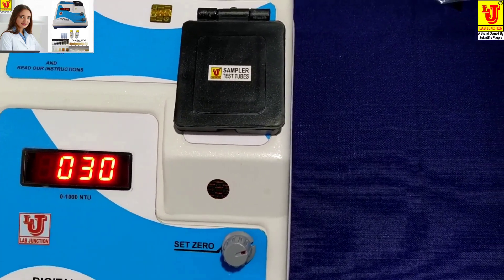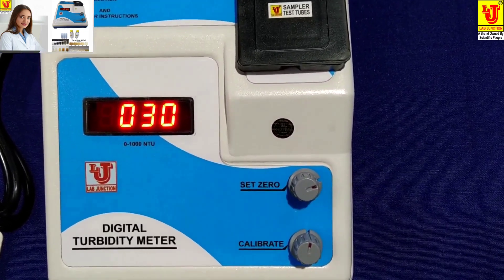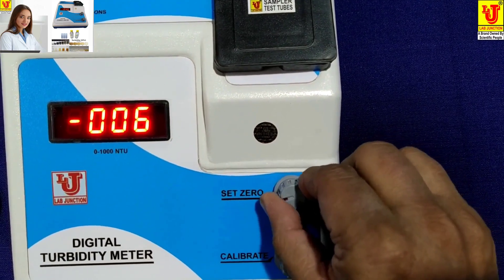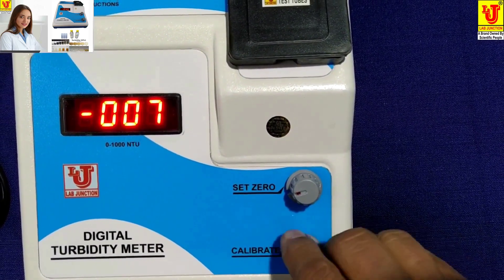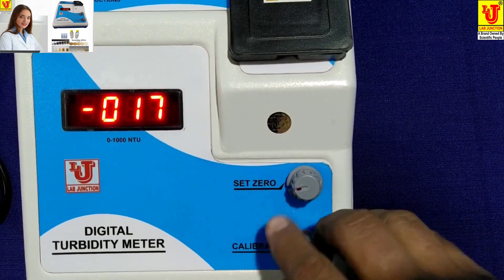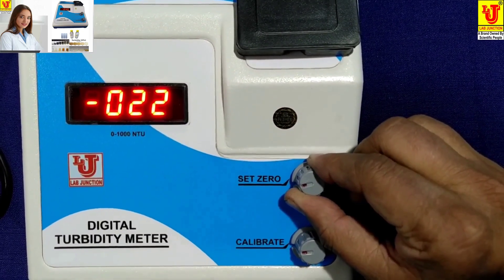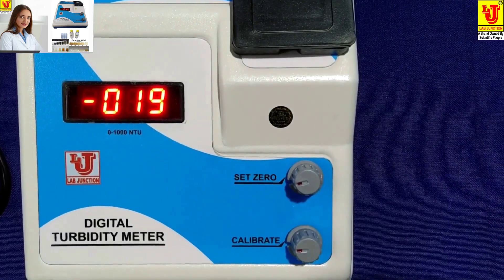First of all, you have to set these two controls. Set 0 to minimum position — turn it anti-clockwise. And set the calibration control to maximum position — turn it clockwise. Set 0 to minimum and calibration control to maximum before starting.